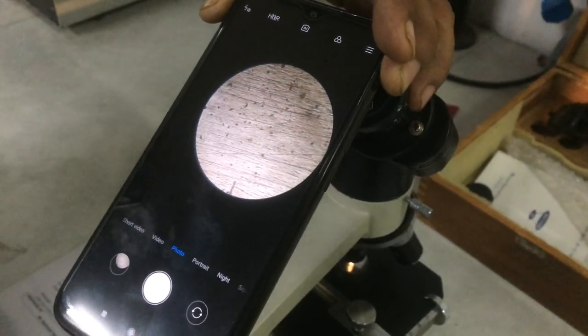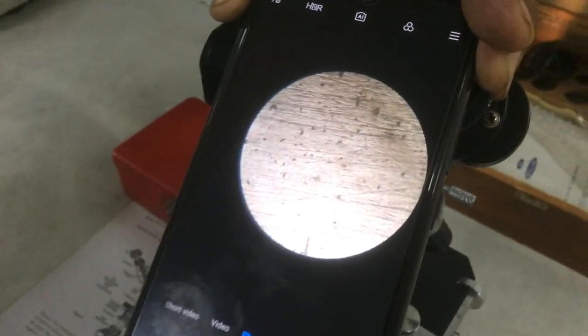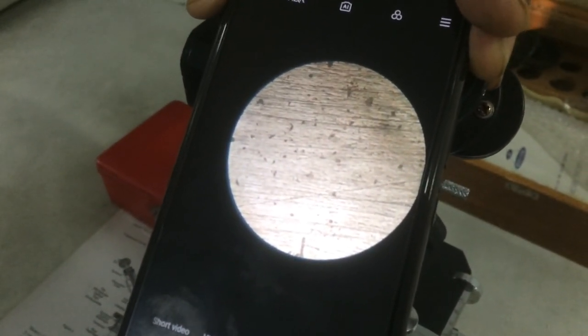So as you can see this is our workpiece. And through the microscope you can see the structure of this particular specimen.